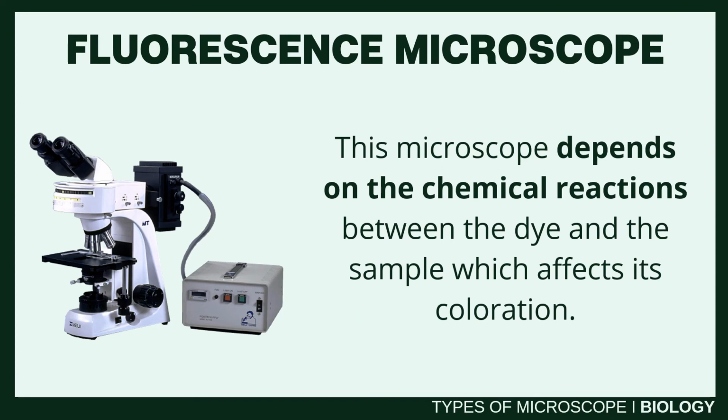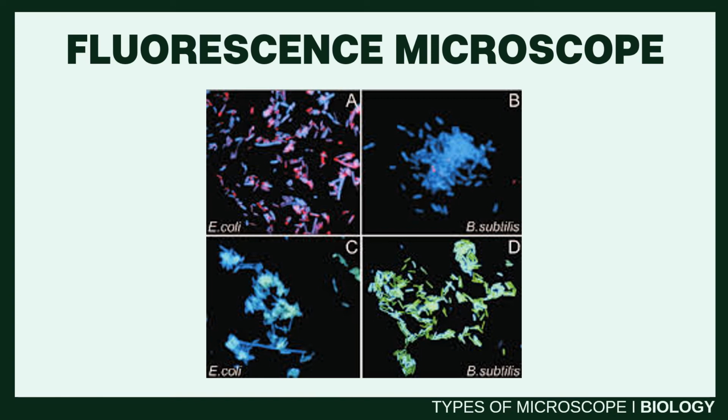The usability of this microscope depends on the chemical reaction between the dye and the specimen. This is an image of a sample specimen observed under a fluorescence microscope.